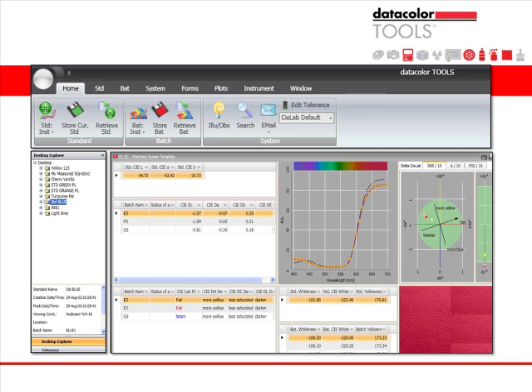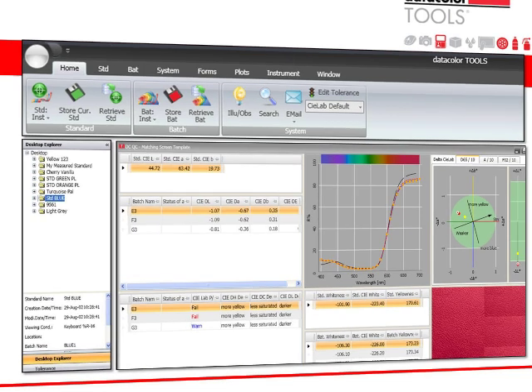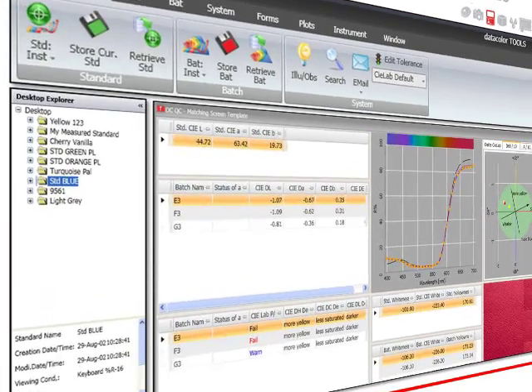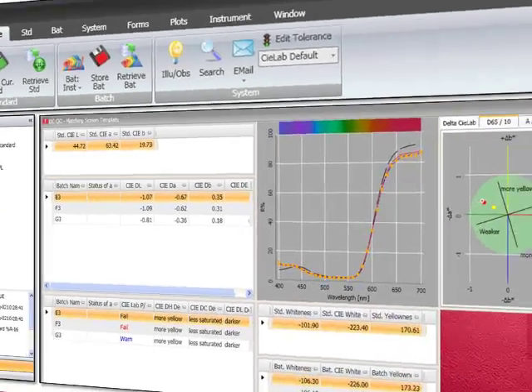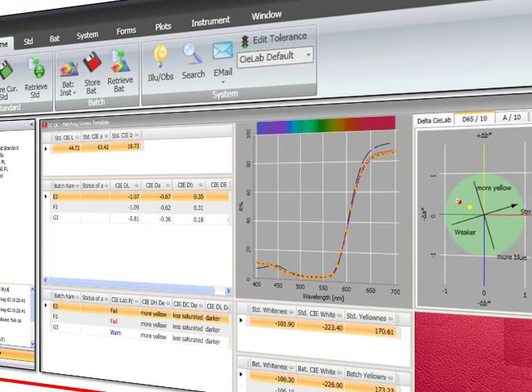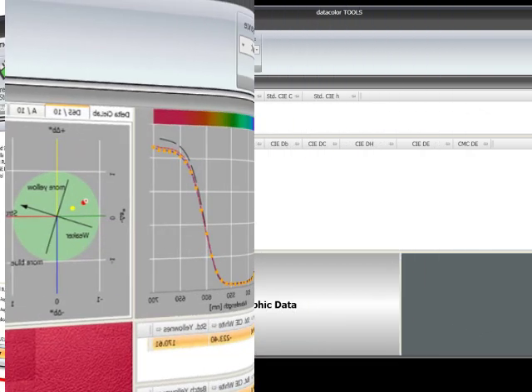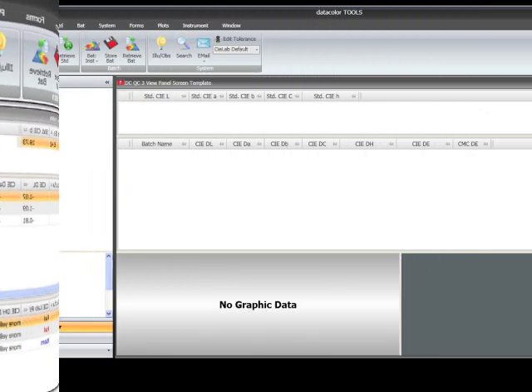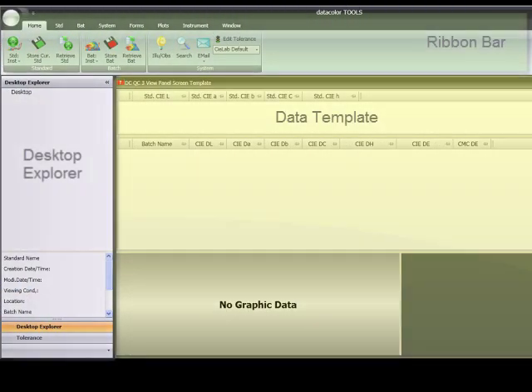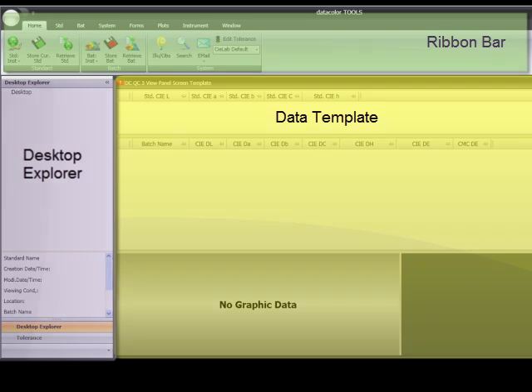Data Color Tools employs the use of a desktop environment and offers immediate visibility to manage and view desktop data from one place, as well as access most QC operations for standards and batches with one mouse click. When the program opens, the screen contains three areas. We will give a brief overview of these areas and then go into each one in detail.